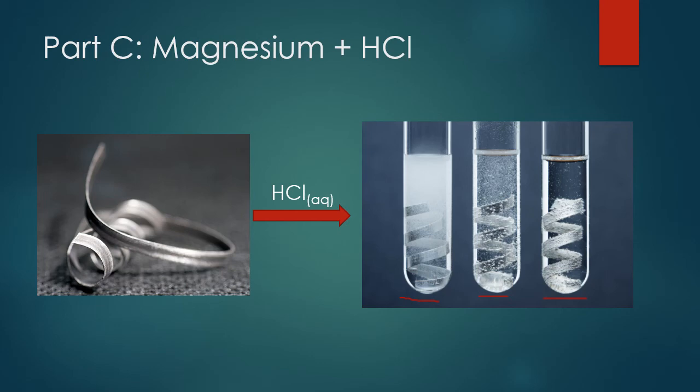Now, if you were holding on to this flask during the experiment, you would actually feel it heat up because it is an exothermic reaction. Make sure you're writing that balanced chemical equation for the reaction, writing down the states. So make sure you're including your aqueous, gas, all of that. Magnesium's a solid, so you put an S by that.